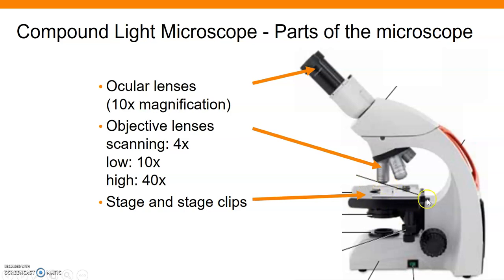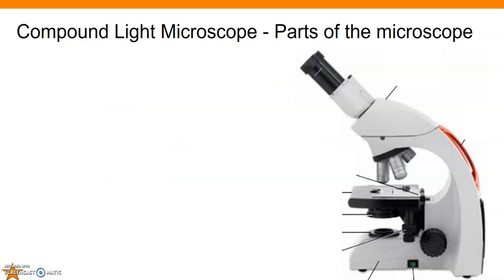In order for us to talk about focusing, basically the stage is what we need to move around. The stage is going to move up and down and left and right. That's part of getting used to how your microscope is going to work. In order to control that, we have a few things we can use. First, there's this little dangly, it's actually quite firm, like a stick that hangs down off of this stage. This right here is called the mechanical stage control. There are two knobs. One will move it front and back, and one will move it left to right. That will actually physically move the stage clips left and right and front and back.